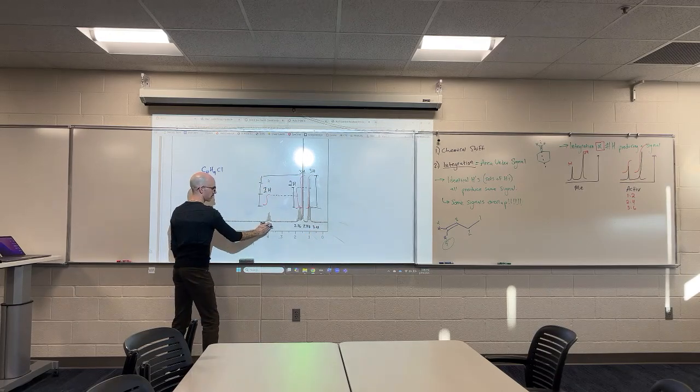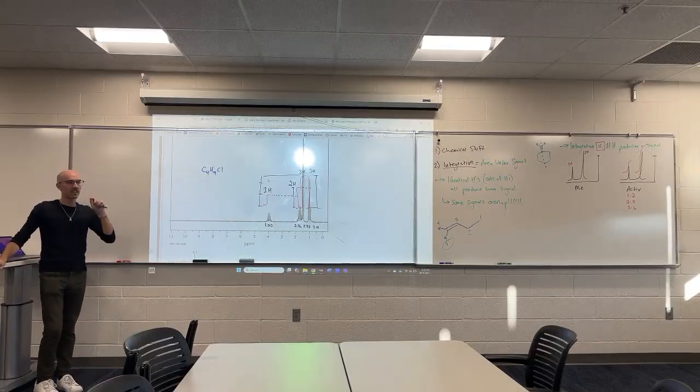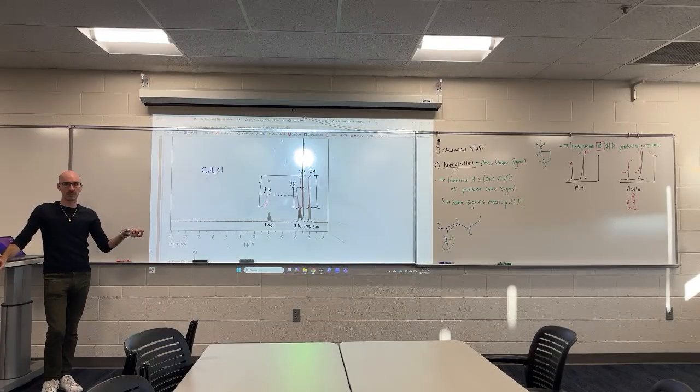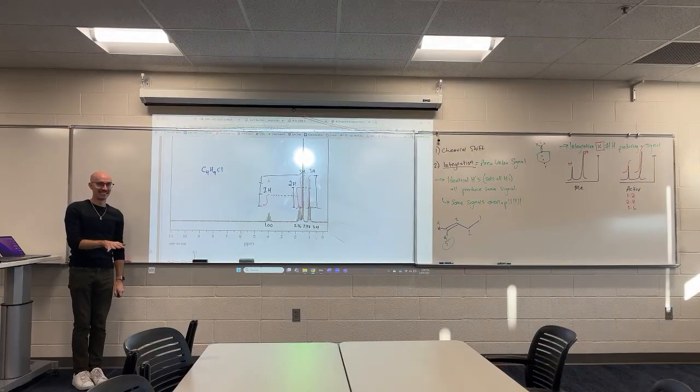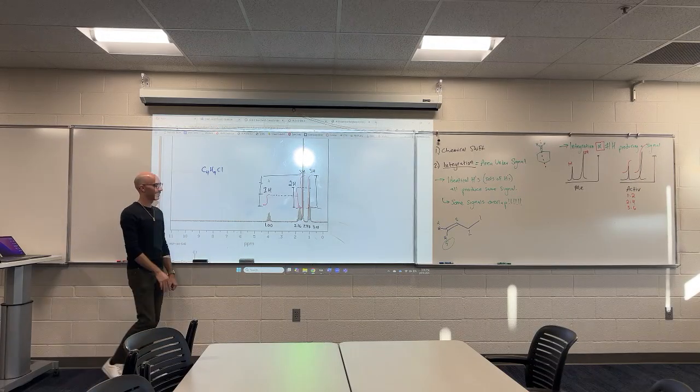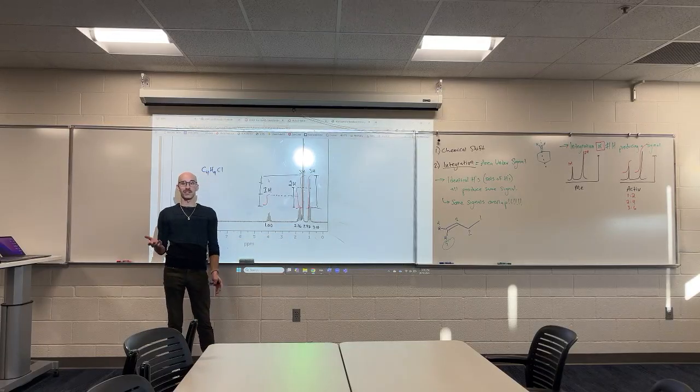I don't know why I went to such different decimal places. The computer gives you real numbers, at which point you have to have a little bit of a wavy hand to say 2.16 is not 2, but it's close to 2.